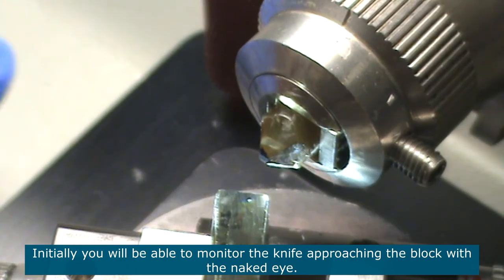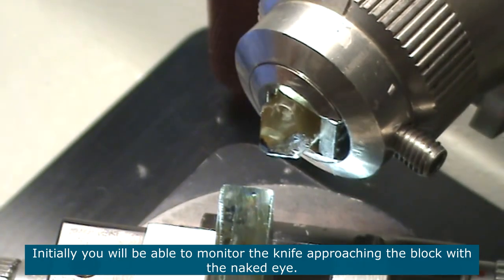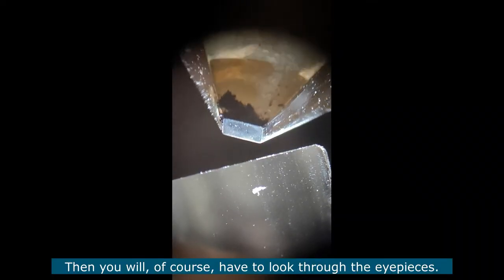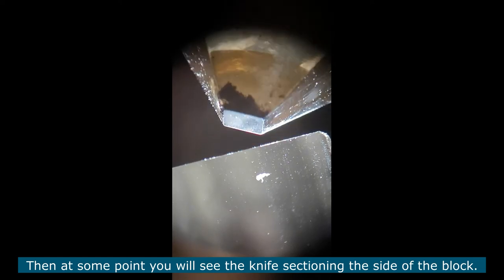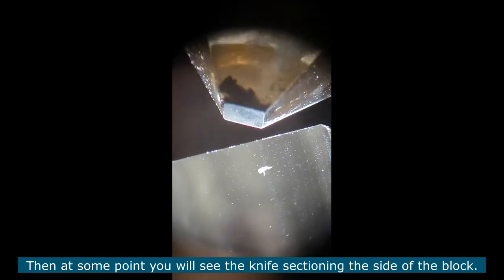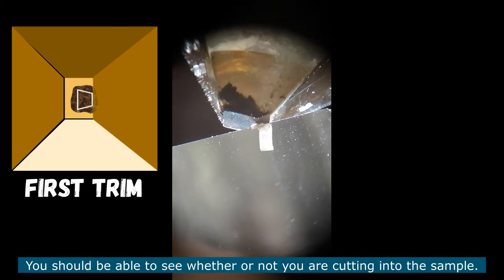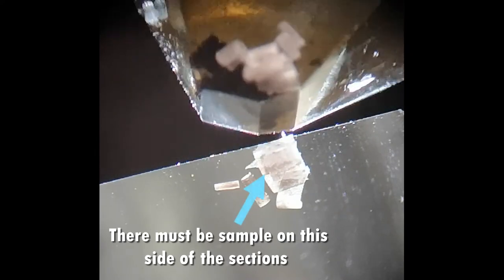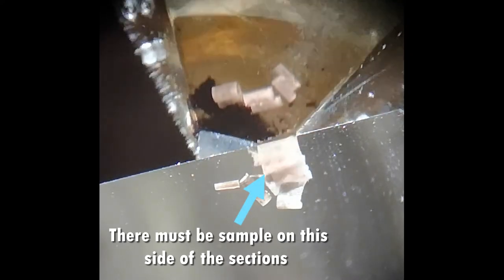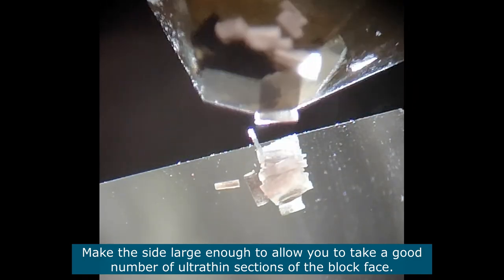Initially you will be able to see the knife approaching the sample with the naked eye. As the knife gets close to the block you will of course have to look through the eyepieces as you approach, and at some point you will see the knife sectioning the side of the block. You should be able to see as the sections come out whether you have sample on the whole side or not. Trim well enough into the block so that you have a side large enough that when you start taking your ultra thin sections, you will be able to take a good number of them.